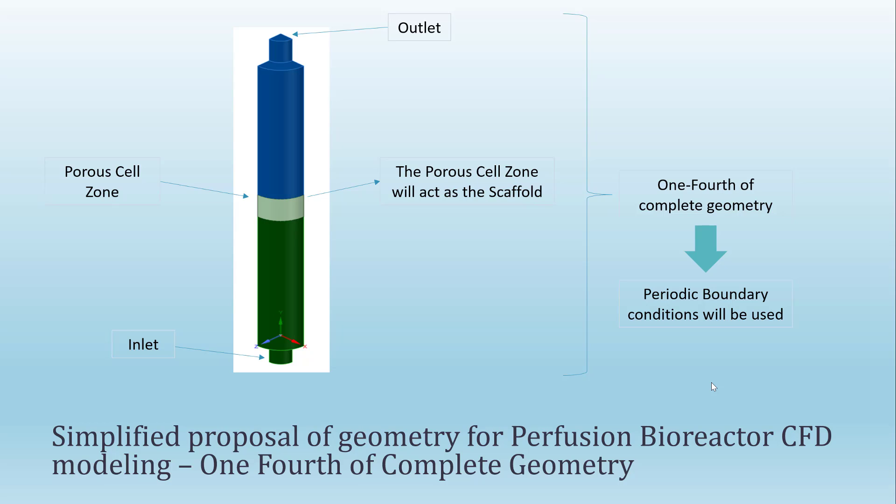For both cases, the same methodology is used. Initially, only the continuous fluid is solved. Once the flow fields are completely solved, the particles will be injected. The particles will represent the cells inside the bioreactor. Right now, I am going to show you how to set up these models using ANSYS Fluent.